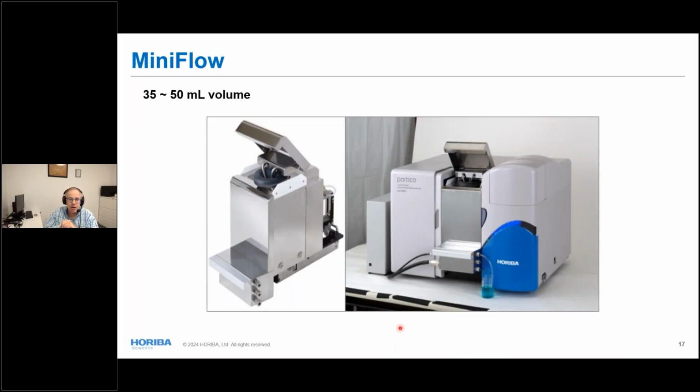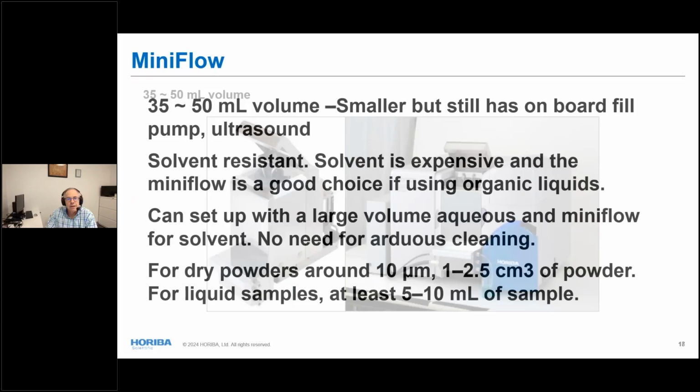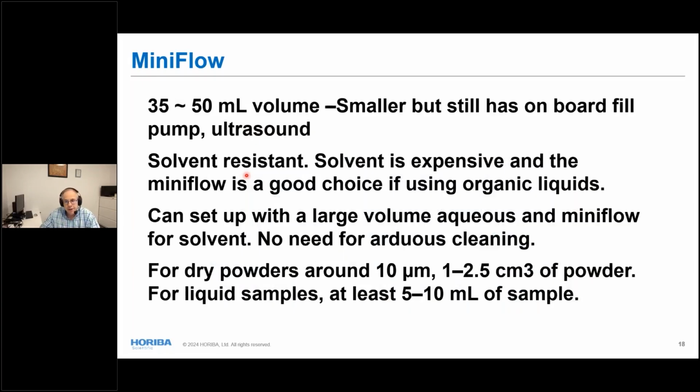So it's a smaller volume at 35 to 50 ml, and it slides into the instrument. There are a couple nice things about this. The most obvious is that you have a much smaller volume. It's about a quarter of the volume.